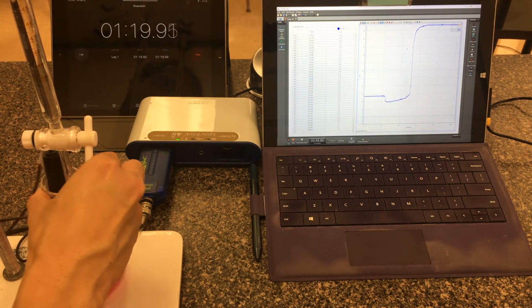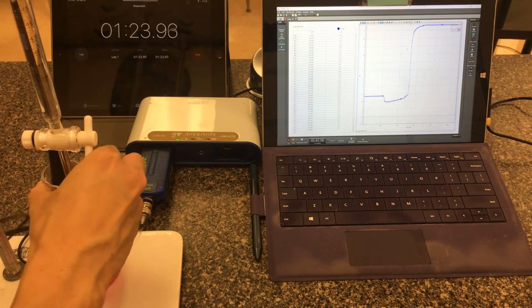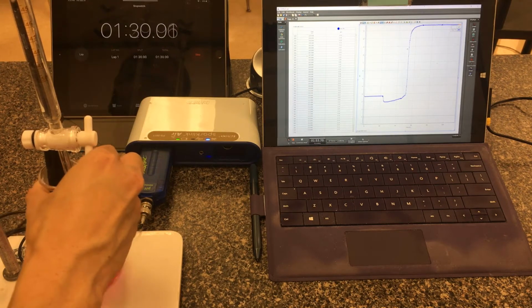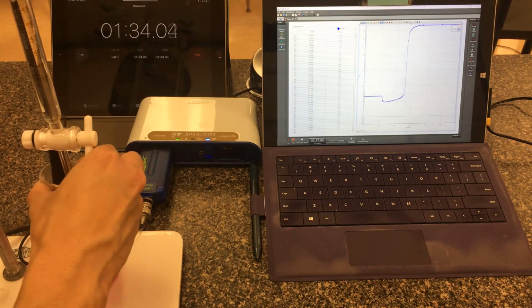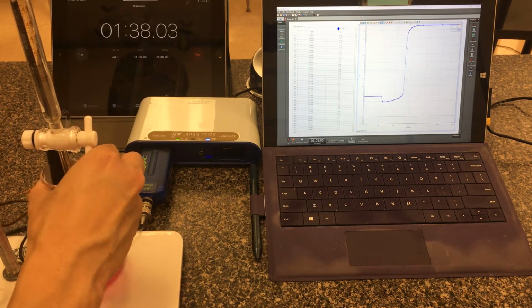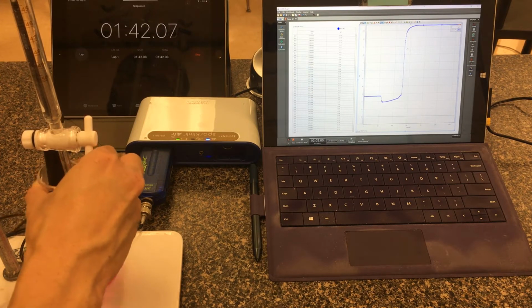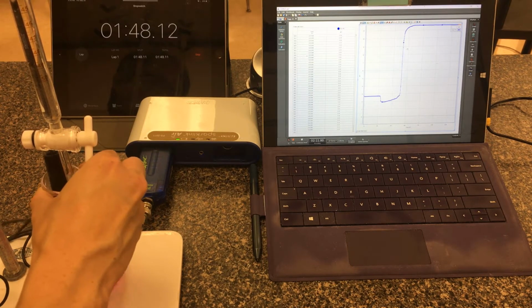We've dispensed about 30 milliliters at this point. You'll notice that it's way pink. Normally we would have stopped the titration way before. But armed with a graph like this and the data table, we can actually do some curve calculations. Where the pH suddenly jumps is going to point out to us where the equivalence point is. We can do some calculations with pH at half volume and the initial pH with an ICE table to try to figure out the initial concentration. So just continue to swirl this around. Okay.